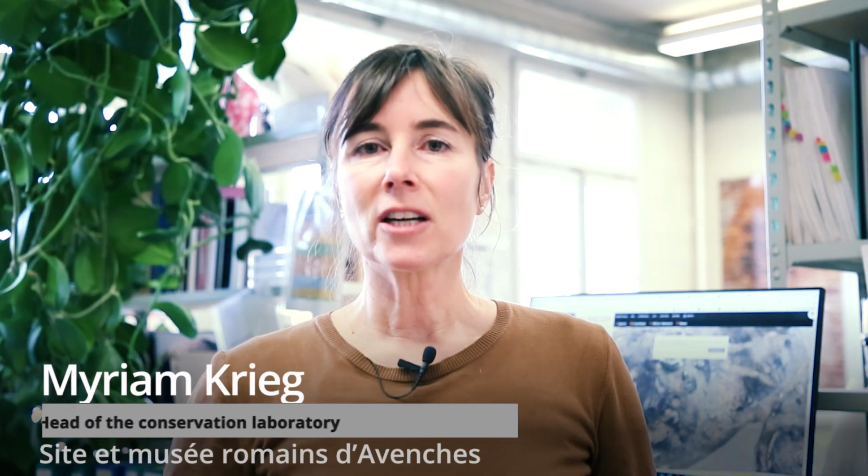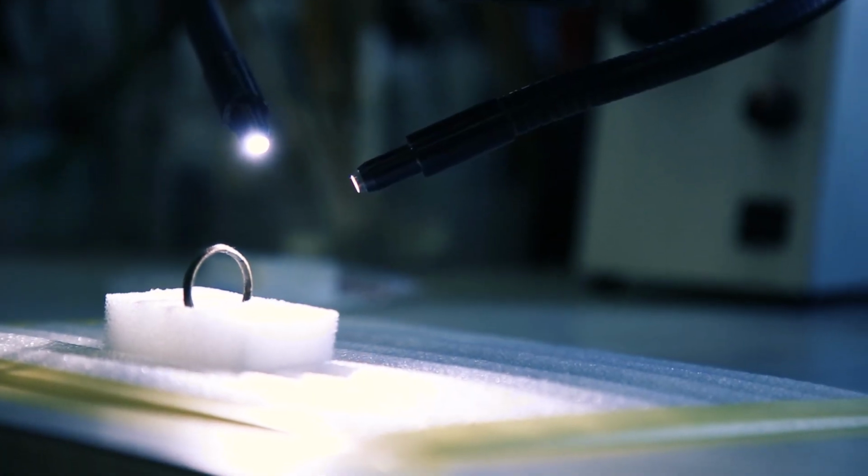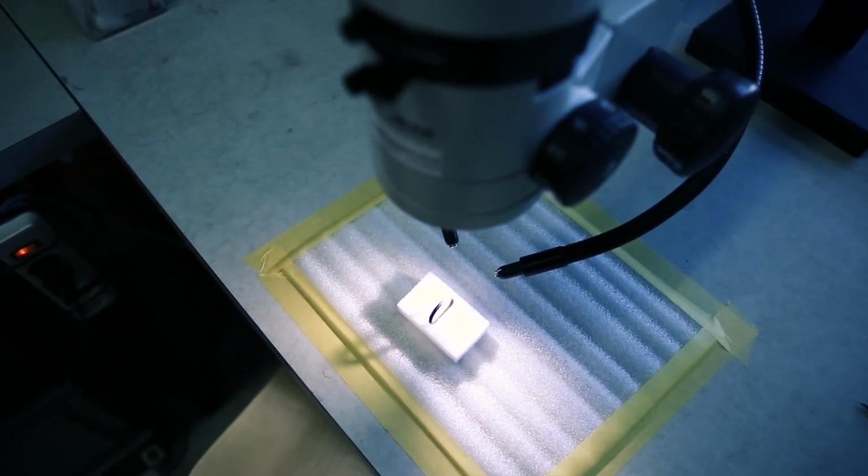We are in the Laboratoire de Conservation Restauration in Avenches, Switzerland. Avenches is an archaeological site with lots of archaeological diggings. And we have regularly metal finds coming in this lab, which have to be conserved and restored. Among these metal finds, we observe copper alloy objects with important flaking and cracking. We'd like to study this phenomenon.